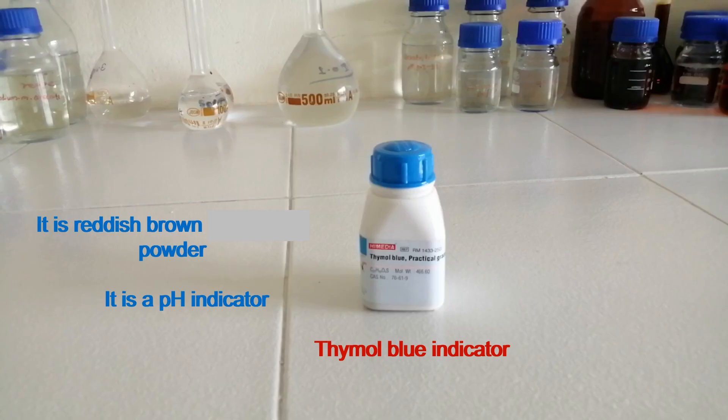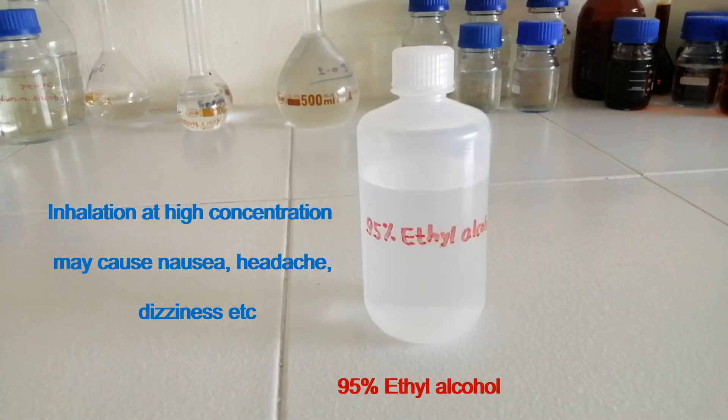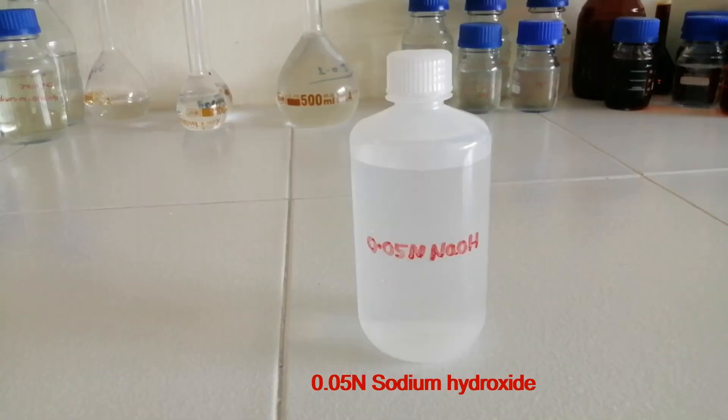This is thymol blue indicator powder. It is reddish brown powder and it is a pH indicator. This is 95% ethyl alcohol. Inhalation at high concentration may cause nausea, headache, dizziness, etc. This is 0.05 N sodium hydroxide solution.